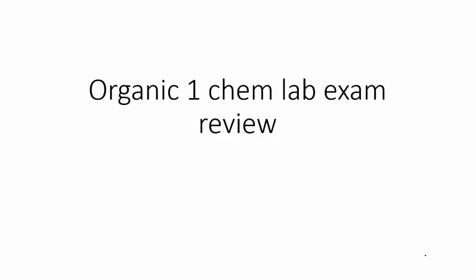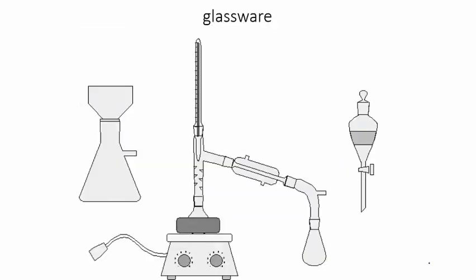This is a long-awaited organic one chem lab exam review. This review is as close as I can get to what you're going to see on the final. Start out with naming pieces of glassware.